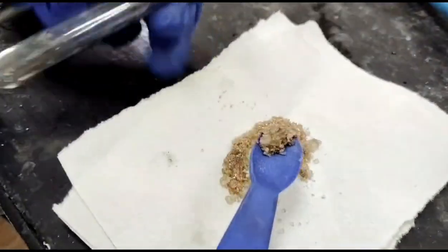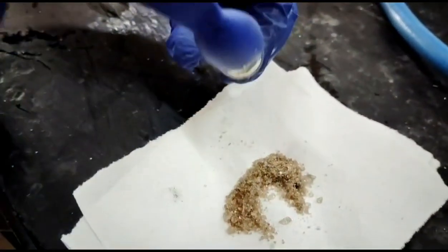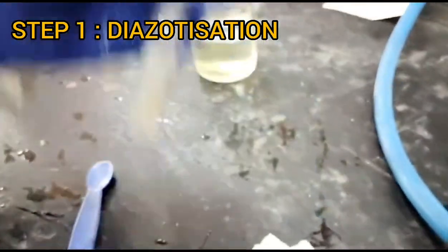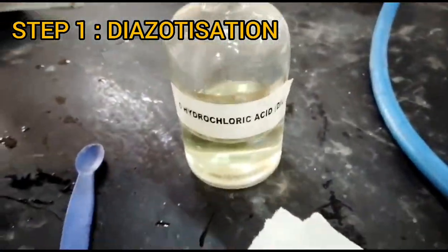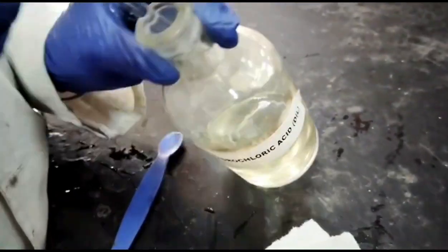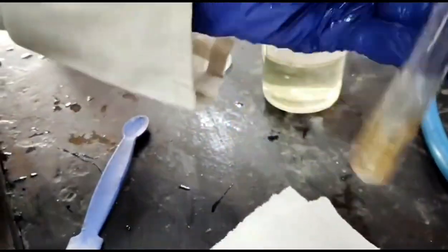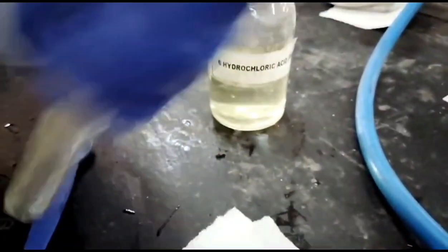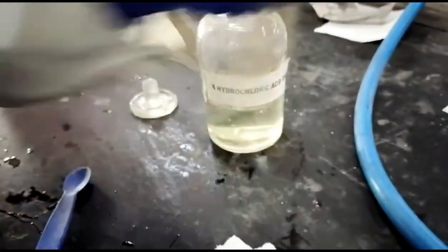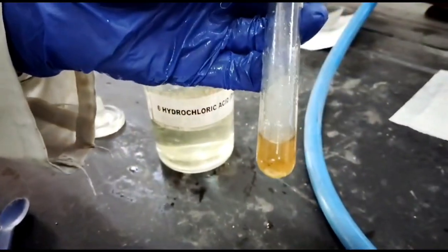Now we will take some organic compound and put it in a test tube. Now we will acidify it with dilute HCl. Now we will dissolve it. As you can see, it is slowly dissolving. It's almost dissolved.